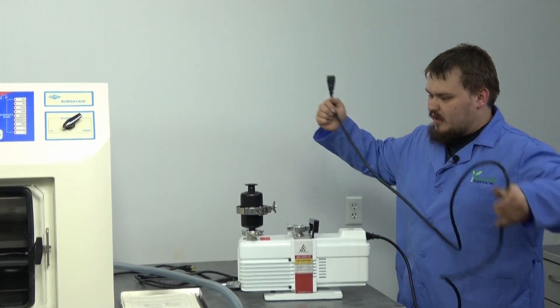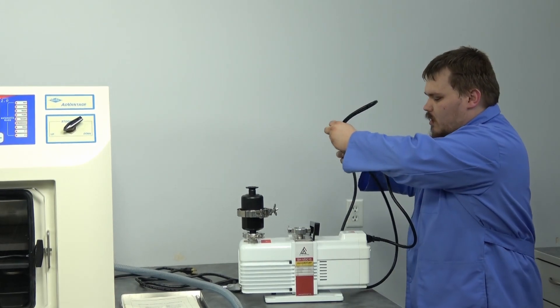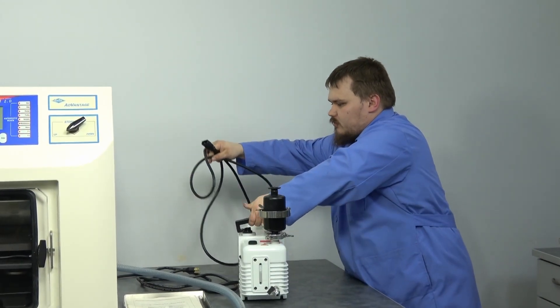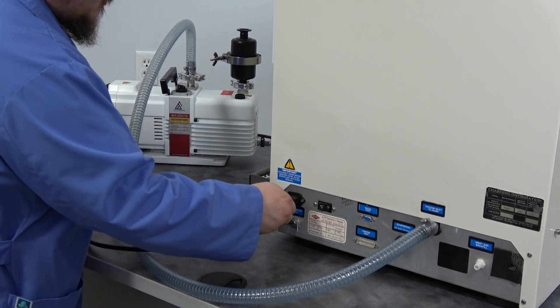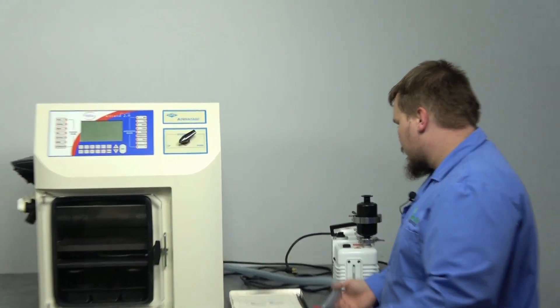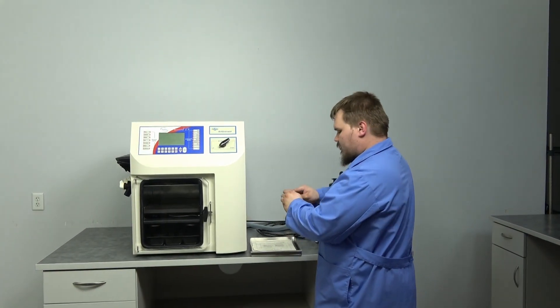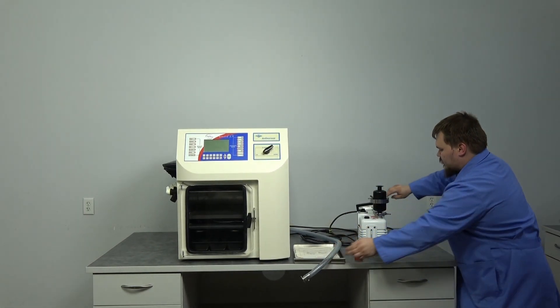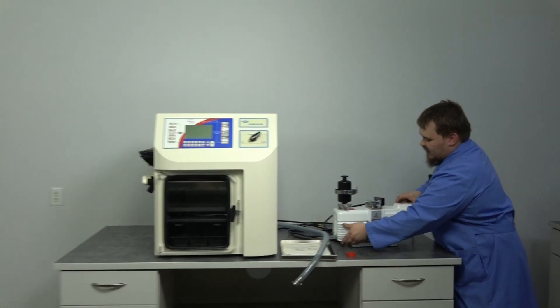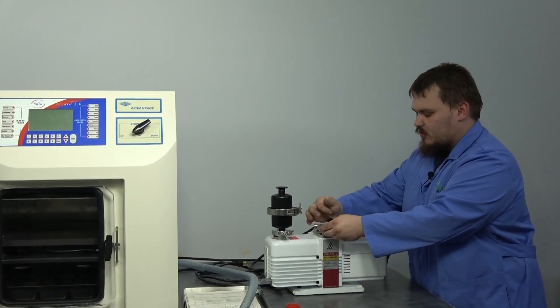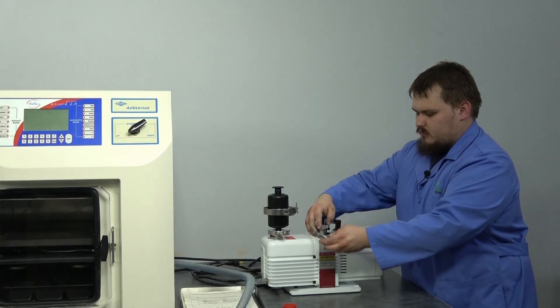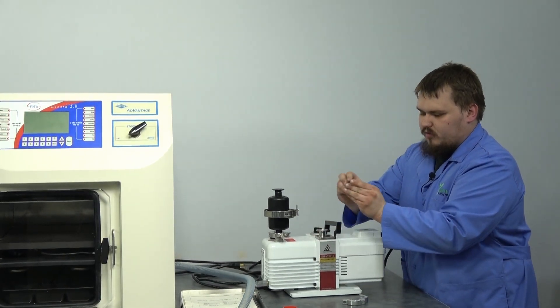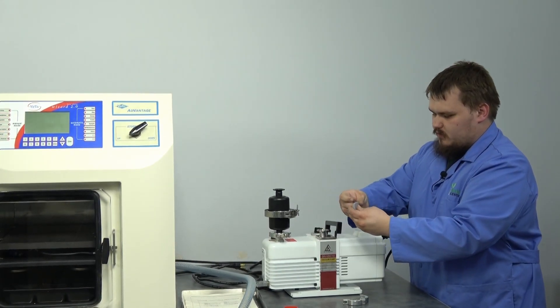And then the other end of the connection is going to go onto the back of the machine. From there, we're going to pull off the caps on both the hose end here and on the vacuum pump—there is a cap on there also.